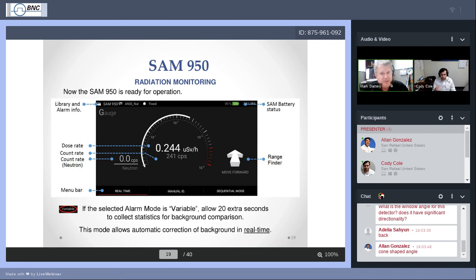Get used to doing these. These are the proper steps. Don't cut corners. Use the device the way it was intended to be used. And this also gives you an opportunity, maybe if you want to try and play with the cursor on the horizontal axis, touching that and clicking or touching and dragging with your finger. You can double check whether your calibration has been successful by taking a rough look at the position, what energy is at the center of that potassium-40 peak.